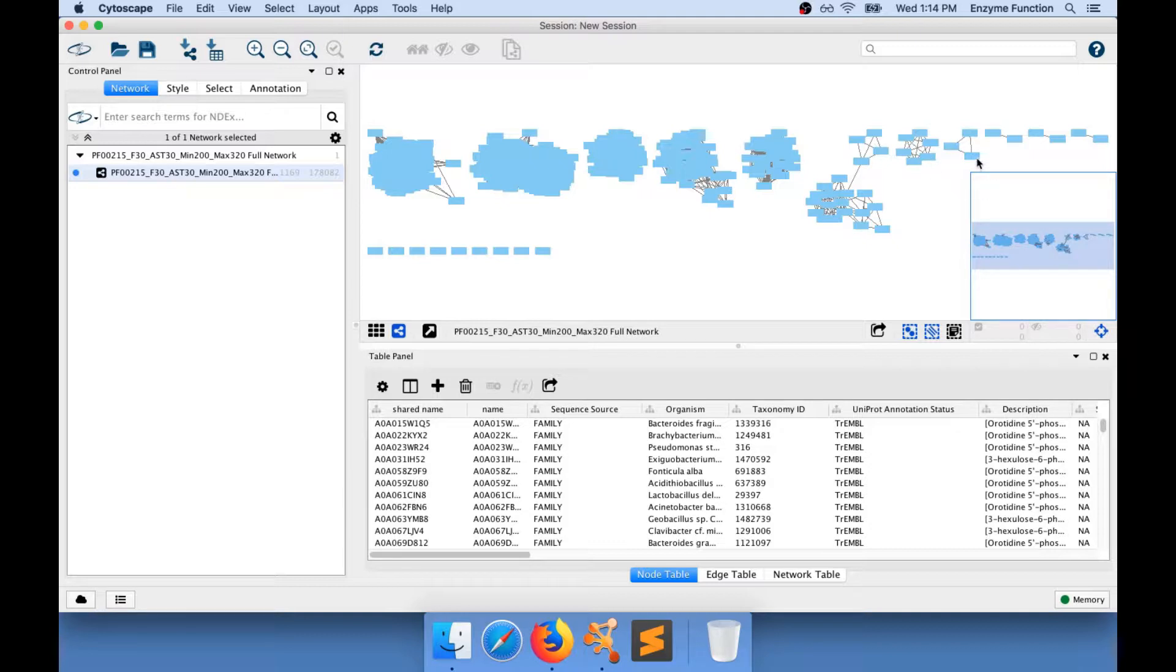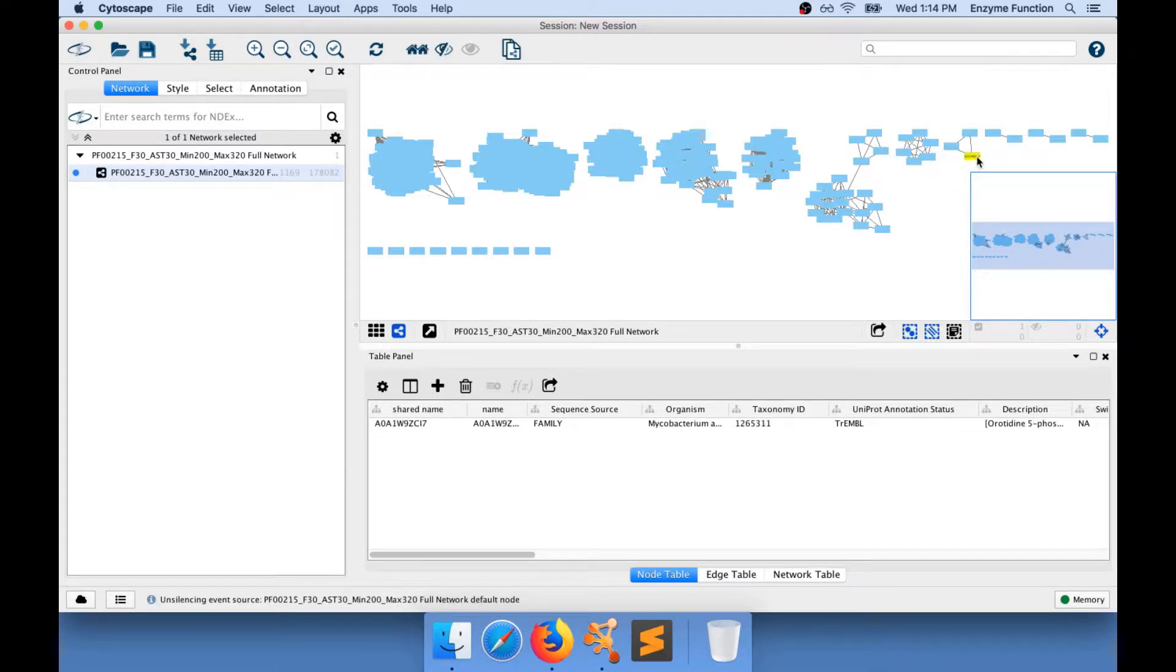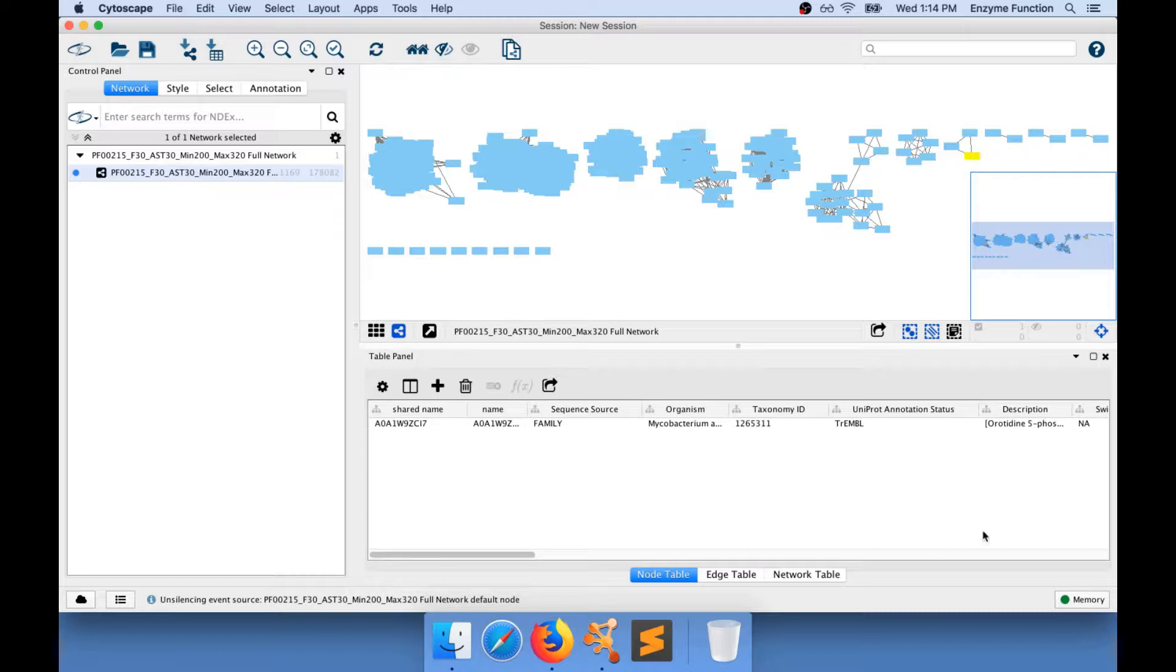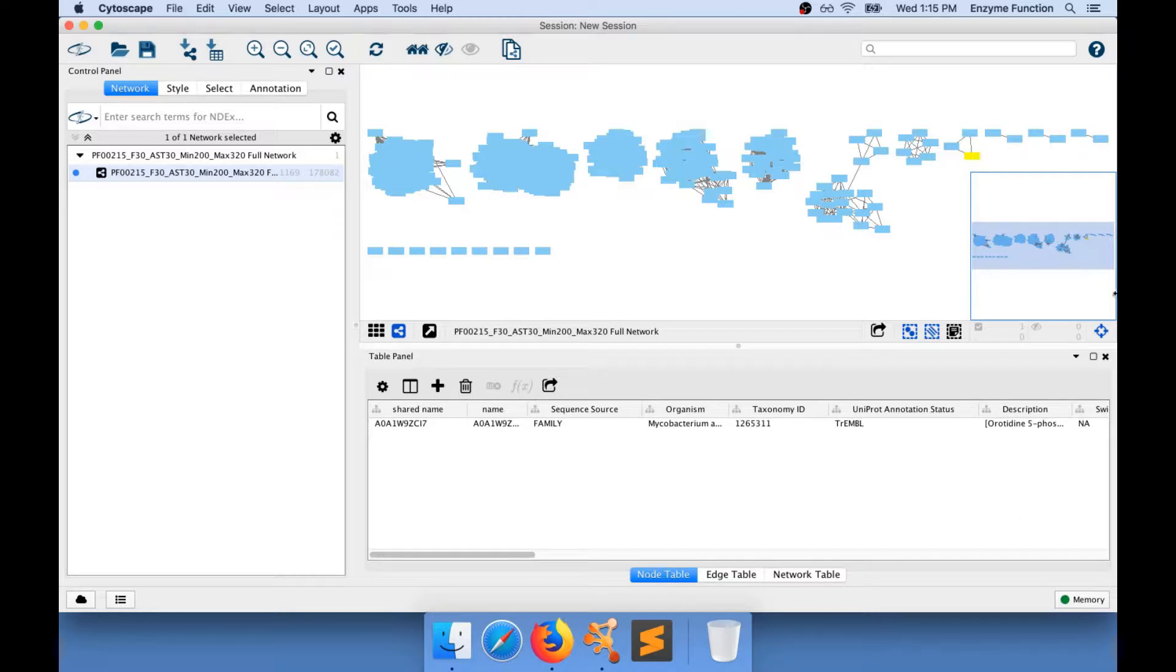As you've seen, by clicking on a node, you can select it. In Cytoscape, we have the table panel that is present in here and you can see that I'm looking at the node table right now.